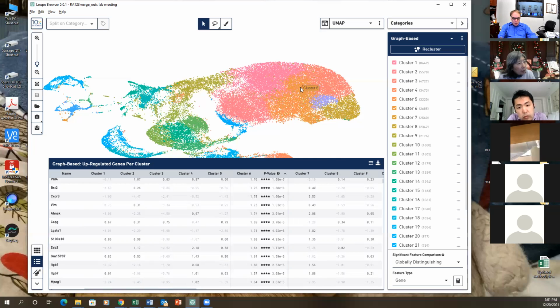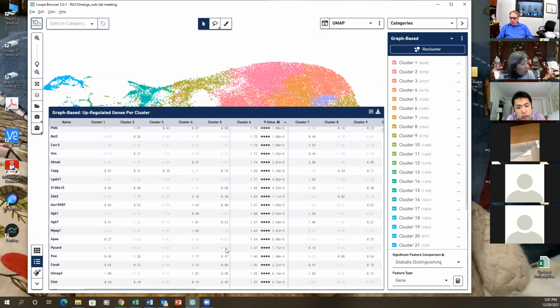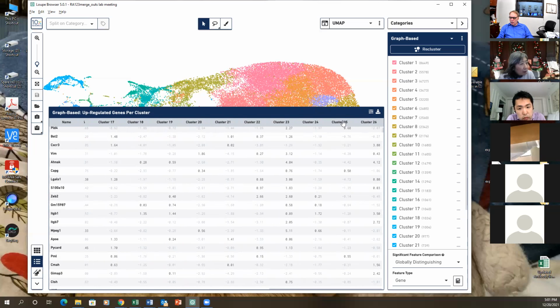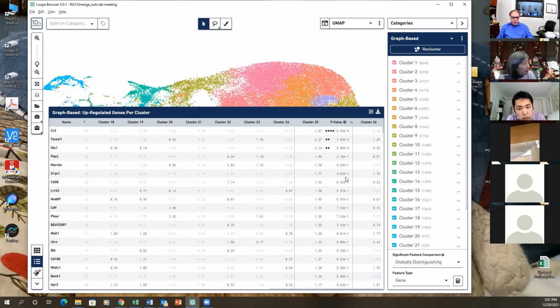I don't know, but they really got in here. Can you look at what genes are there? The orange little purple one. That might be a DN2 precursor. I don't think so. You don't expect them to be that big, a DN2 precursor set.